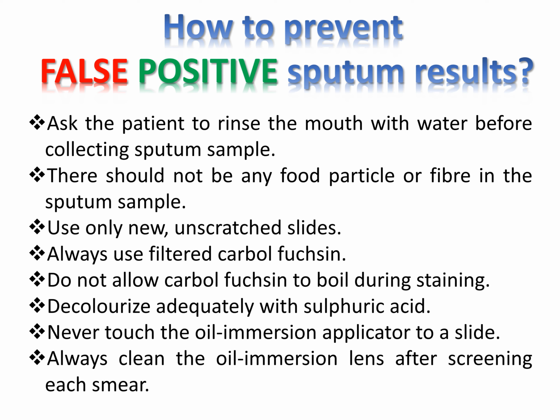Use only new, unscratched slides. Always use filtered carbol fuchsin. Do not allow carbol fuchsin to boil during staining. Decolorize adequately with sulfuric acid. Never touch the oil immersion applicator to a slide. Always clean the oil immersion lens after screening each smear.